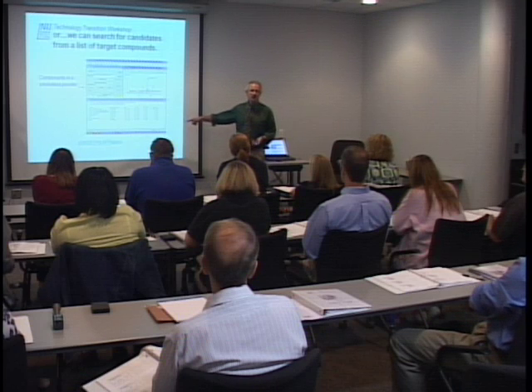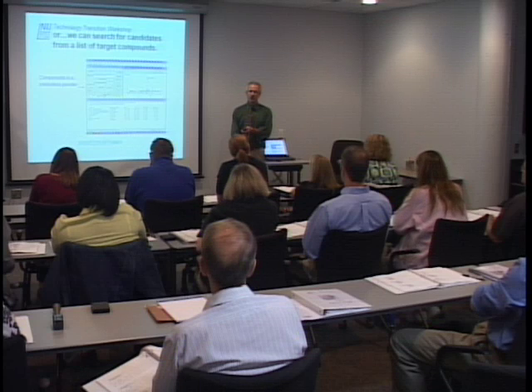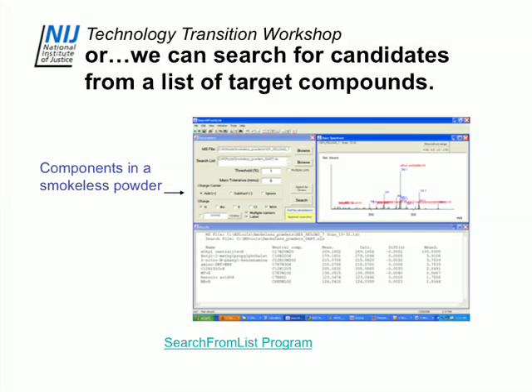It will only label those things that are found within an exact mass tolerance. So if it's looking for cocaine, it'll only label it if you find 304.15488 plus or minus, let's say 5 millimass units. And if it's not within that error, it won't label the peak. It's a convenient way to get a survey of things. We use this for looking at antioxidants and polymers, for looking for explosives in a mixture, for looking at drugs and tablets and things like that.